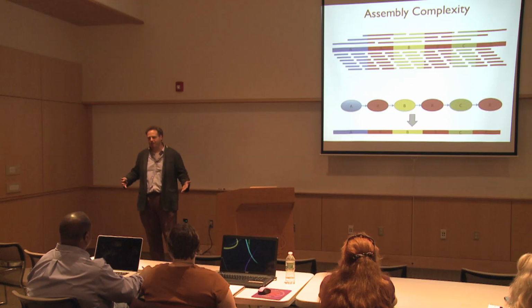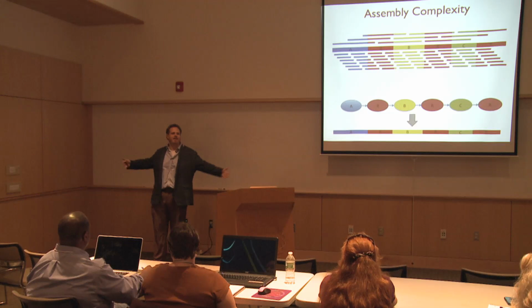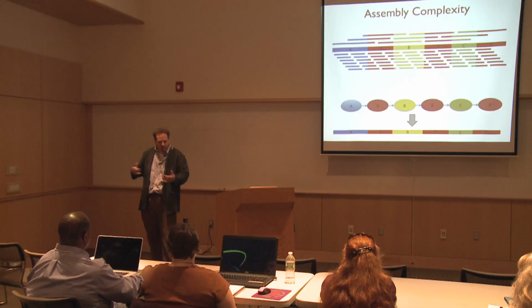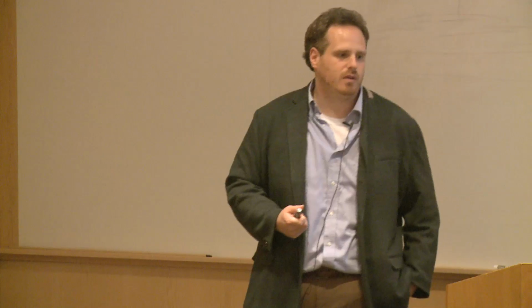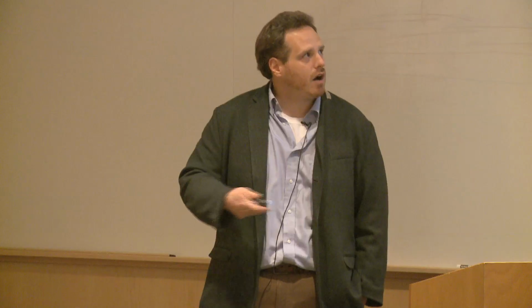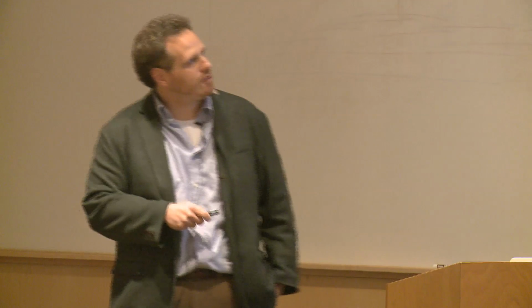You're just absolutely not going to take whole genome shotgun data from a mammalian genome and get entire chromosomes. This is not going to happen. Instead, you're going to get a snapshot of many thousands or many millions of contigs representing different portions of those chromosomes. And there, you'll probably have to do some sort of post-analysis where we're going to use maybe longer reads or mate pairs or optical maps or genetic maps, some sort of other information to be able to take those short contigs and then lay them out into longer and longer segments.